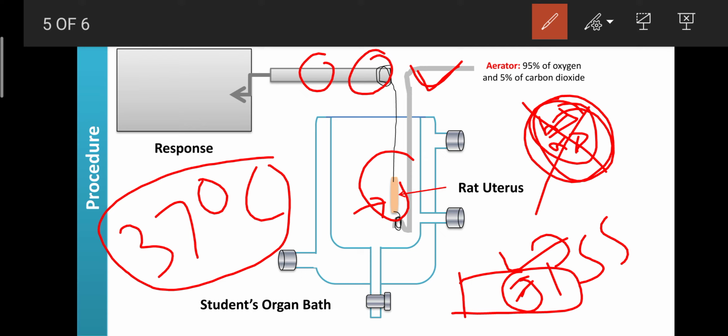Later on, with the help of the 3 point assay or matching assay or interpolation, you can record the response according to Latin square. First you record the response of the standard, then later you record the response of the test. With the help of interpolation, you can find out the unknown concentrations. Or with the help of the matching assay, you can find out if your test sample is less, or if you need more accuracy, then go for the 3, 4, 6, 8 point assay.